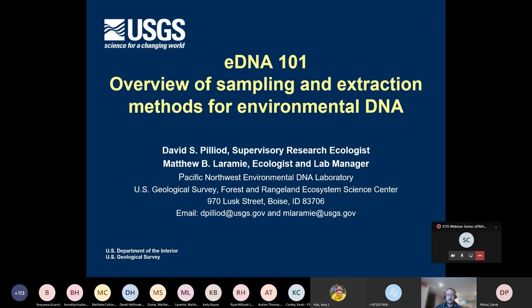Take it away, David. All right. Thank you very much. Welcome, everyone. This is the beginning of a three-part series on eDNA. We decided to call it eDNA 101 as a kind of gentle introduction. But in this first part of the three-part series, we're going to be focusing on sampling and extraction methods.